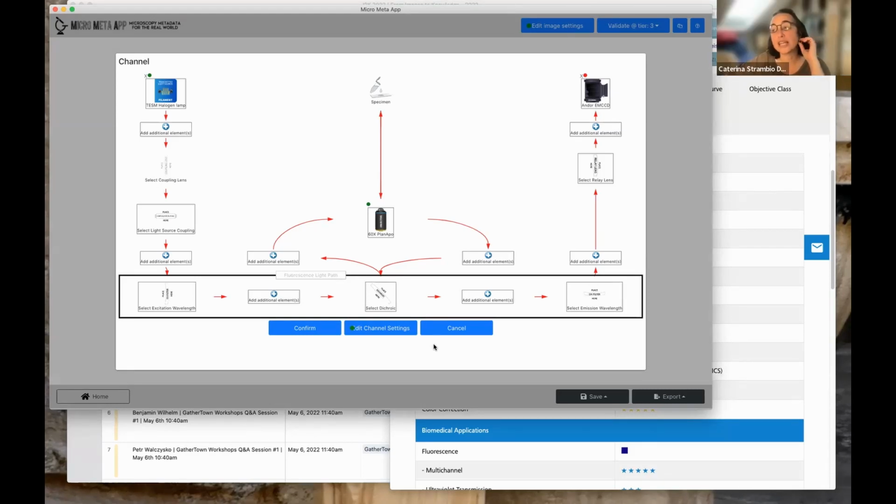So this is obviously a really important question. As far as defining the hardware, it can be done once and that's it. As far as defining the settings, we will need to do a better job at automating some of these aspects. For example, one thing that we're working on is you enter it once for an image in a data set, and then it can be applied to multiple images in that data set.